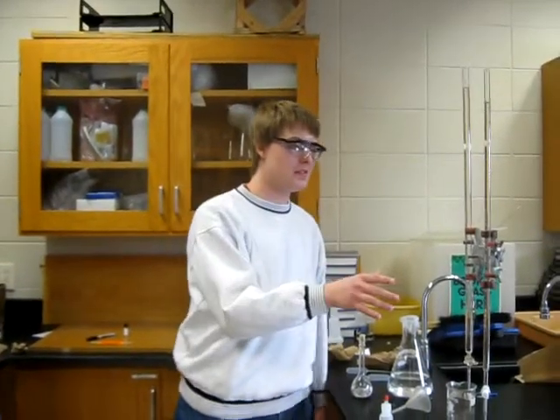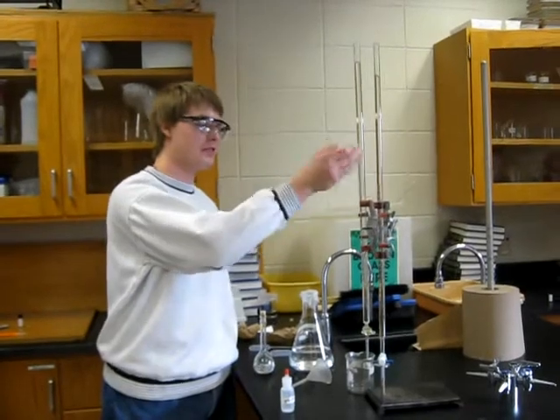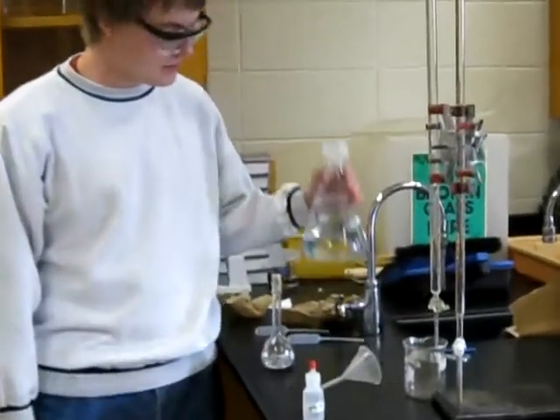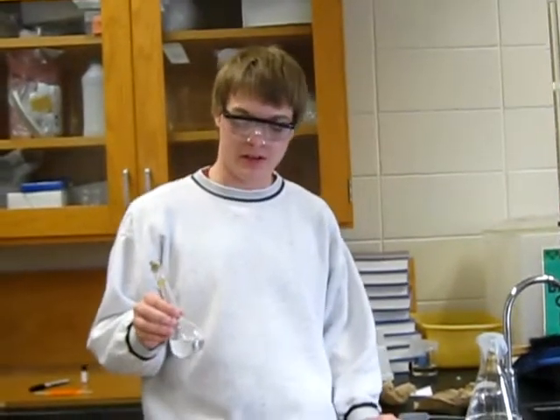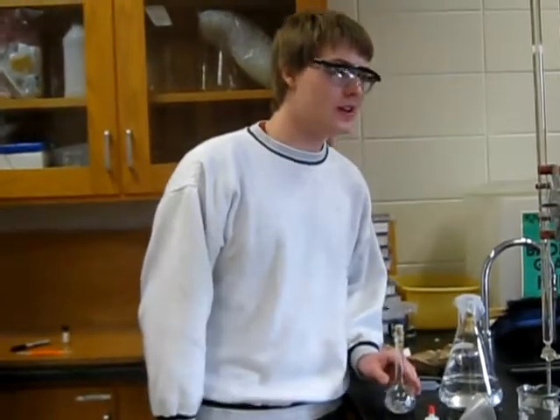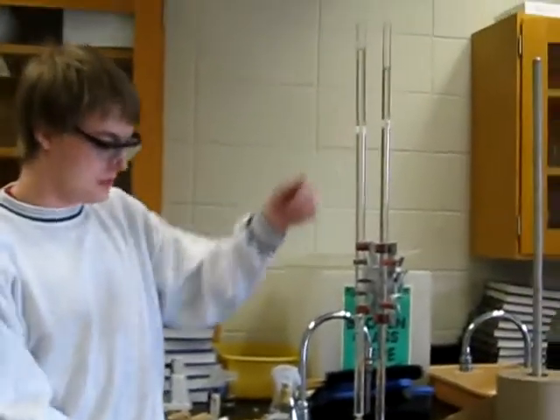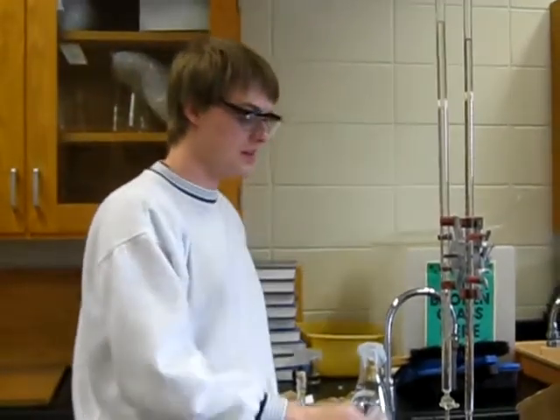Okay, for this experiment you'll need 2 burettes. One will be full of a base, one will be full of an acid. The acid we will be using is HCl, which we do not know the molarity of, and NaOH, which we already explained is 0.5 for the molarity. You'll fill up the burettes with the funnel to make sure you don't make a mess, up to the 0 mark.